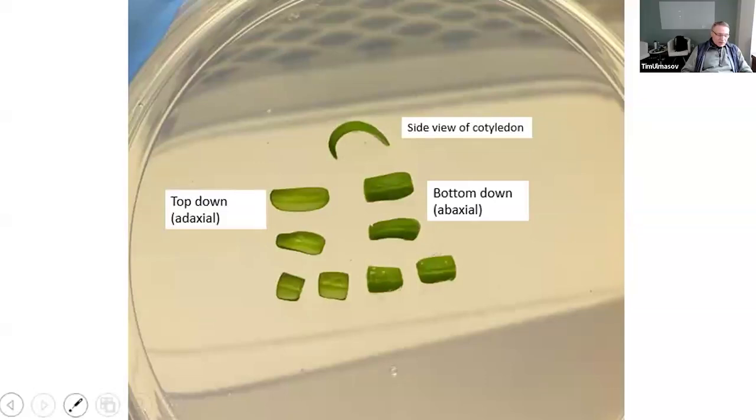That's kind of accepted in the field, that it probably should be the target for everything. But I'm not sure how much really solid experimental data there is to support that. Yeah, for us, it was definitely true. And it's not just for transformation efficiency, it's also for overgrowth.